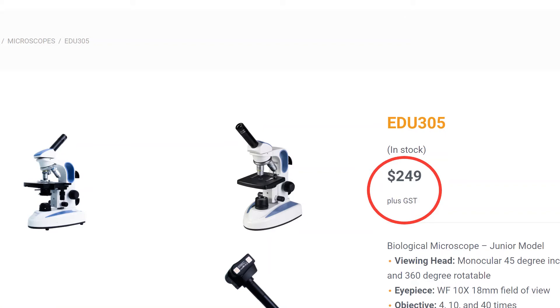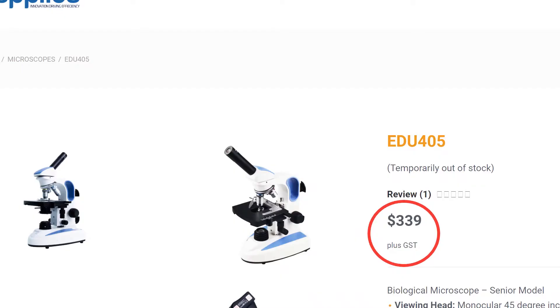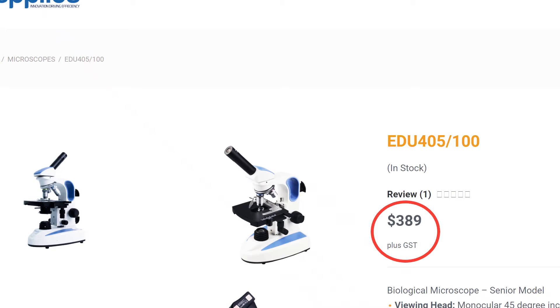We currently have two microscopes: the EDU 305 which sells for $249, and the EDU 405 which sells for $339. This can also be converted into an EDU 405-100 which sells for $389. We also provide bulk discount for numbers of units. You can find all the prices of all of our products on our website, as well as getting an instant quote from our quote system.